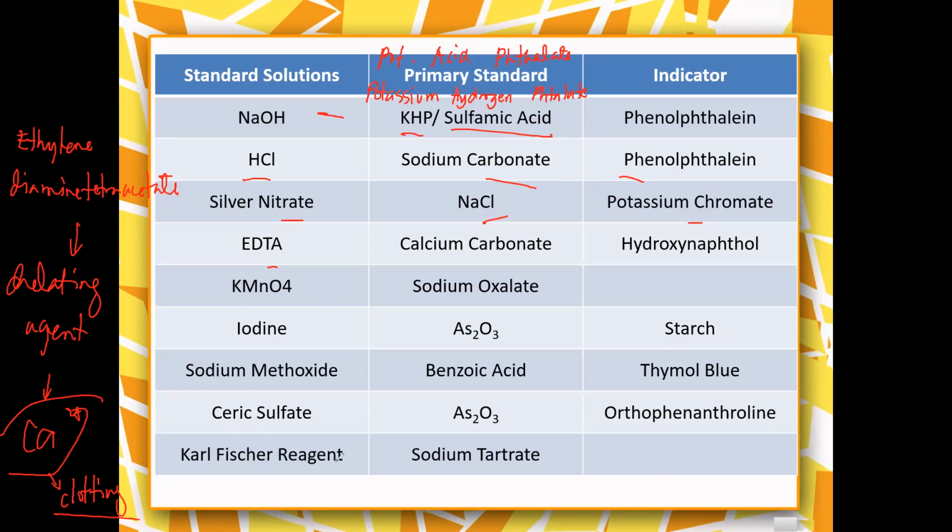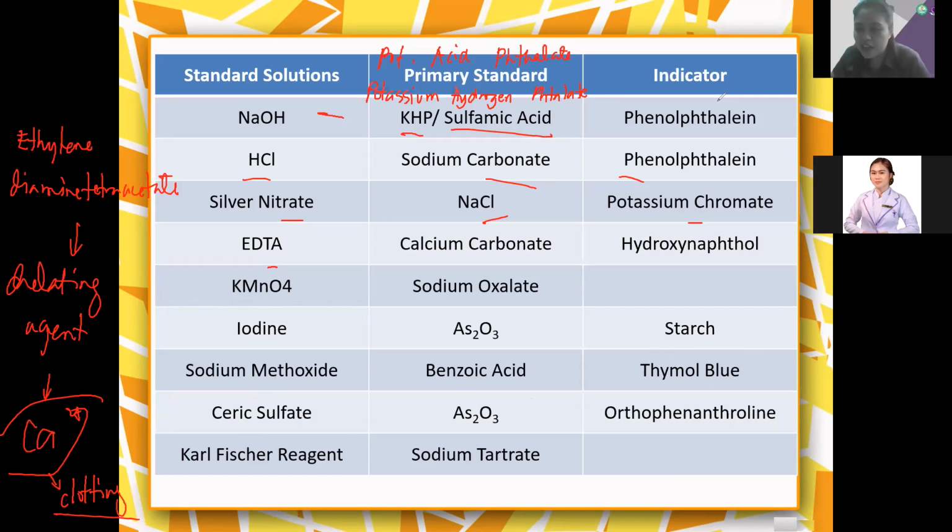Next, we have Karl Fischer reagent. Karl Fischer reagent is used for moisture test. We do that in the QC laboratory. Ang mga tambal bitaw nga ilahang ginabuhat inside the laboratory, like powders na ginagawang tablet. Actually, chine-check yan ang moisture content.